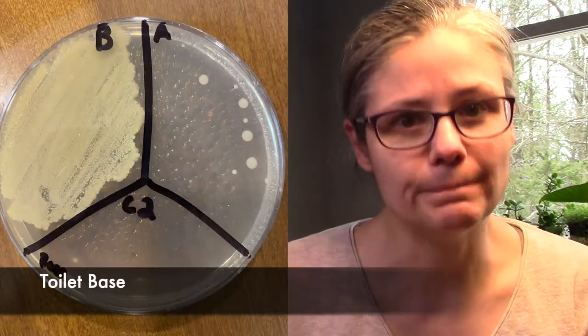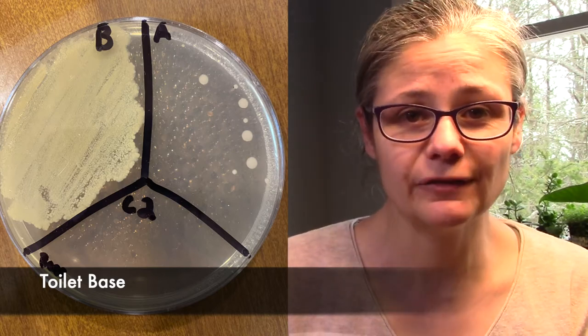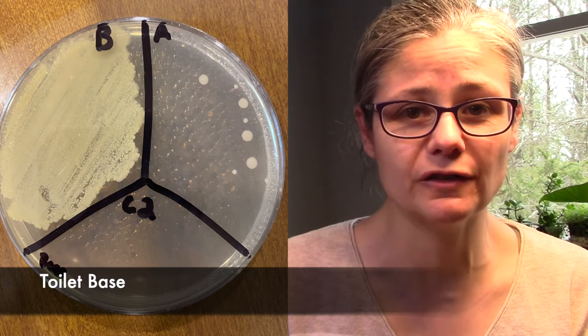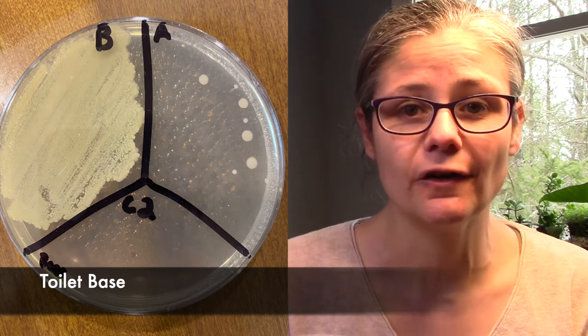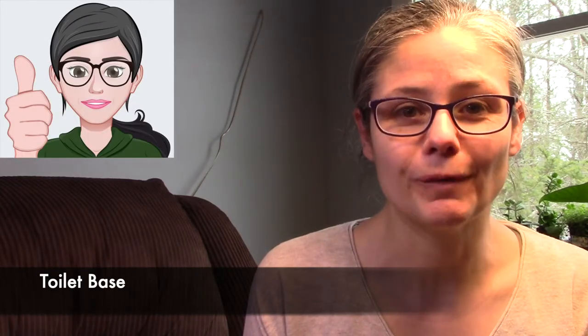The toilet base. Again, we can see a ton of bacteria in the before section, and the after section just has a few bacterial colonies — I counted about eight on the Petri dish. I would say that the Microband does a fantastic job at disinfecting my toilet base.